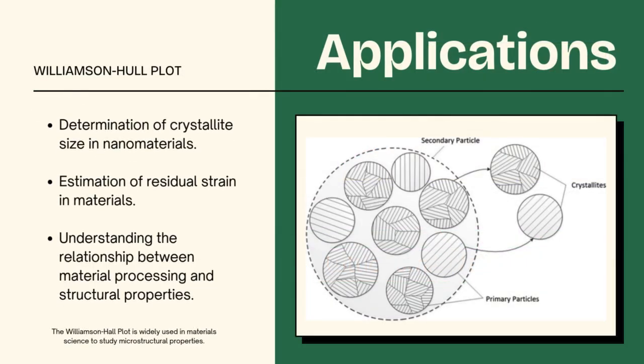The WH plot can be used to determine crystallite size in nanomaterials, estimate residual strain in materials, and help us understand the relationship between material processing and structural properties.